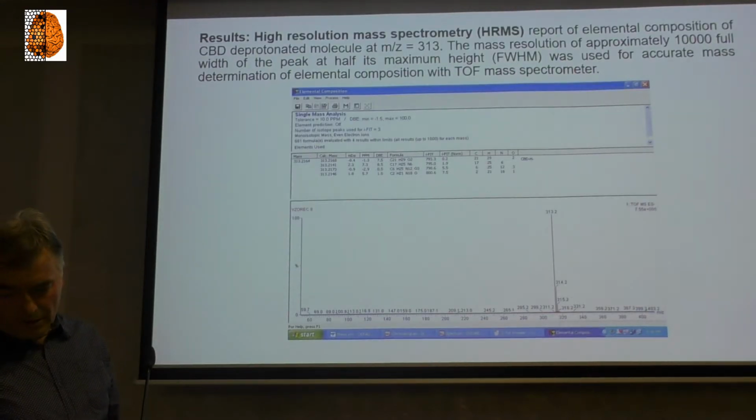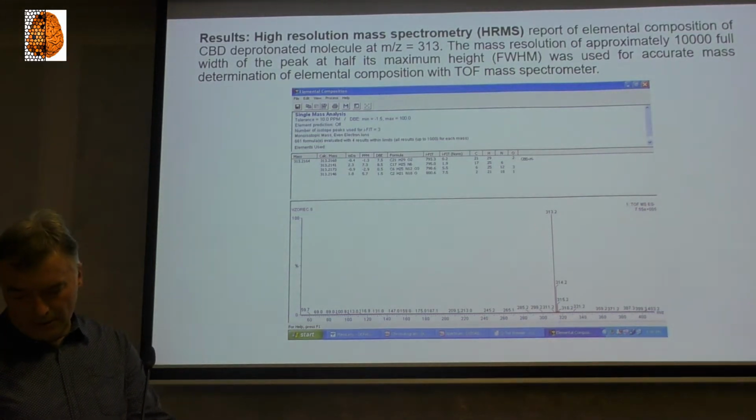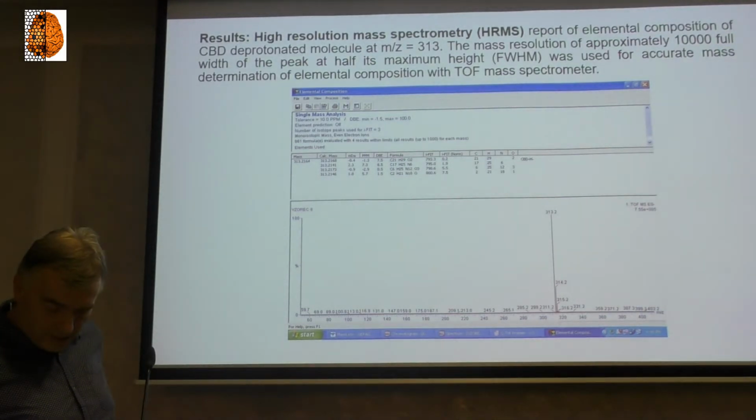With high-resolution mass spectrometric measurements, we can describe also the elemental composition of CBD or THC, and the report of the HRMS measurement is presented on this slide.